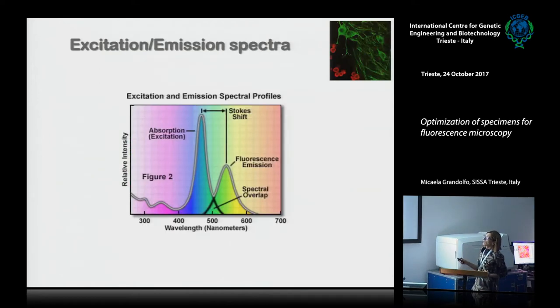Okay, excitation emission spectra, almost the same story: the excitation spectrum, and the emission one at higher wavelengths, lower energy. This is the identity card of every single fluorophore, but it is not enough to choose the right one or the best one, okay?